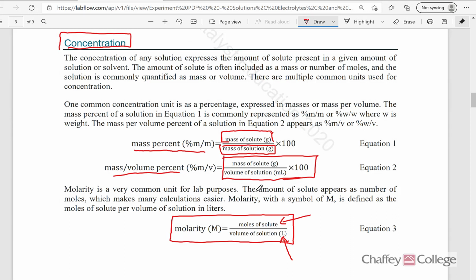In the first section, we will take a look at various solutions, and we will categorize the solute and solvent as polar or non-polar. Remember, like dissolves like means polar solvents will dissolve polar solutes, and non-polar solutes will be soluble in non-polar solvents. In the second part of this lab, we will categorize various solutions as electrolytes.